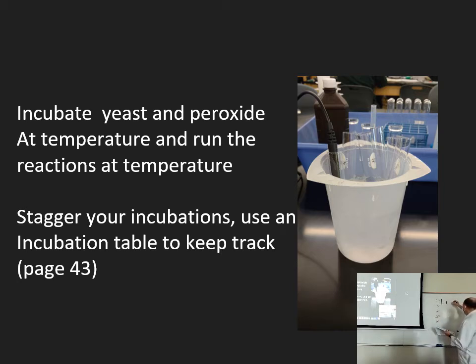Replicate 1, replicate 2, replicate 3. And then this is further divided into time in and time out. In, out, in, out.